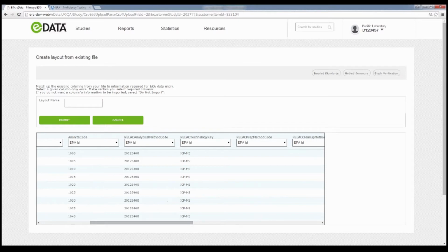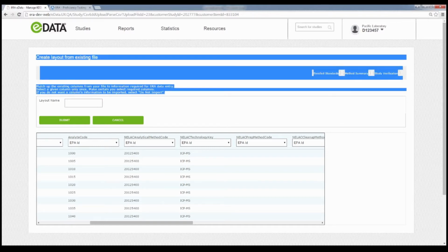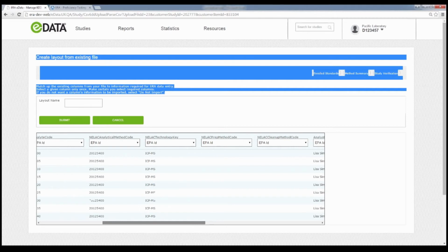Please note that all the data mentioned must match what is in ERA systems exactly, or you will be unable to import your data. Other required information includes analysis date, reported value, greater than, less than, and sample number for the WS Microbiology Sample 10 set.